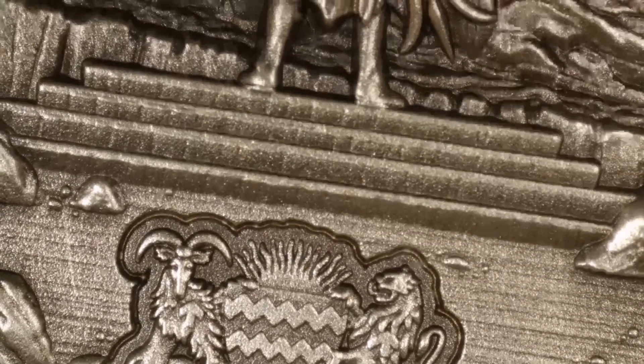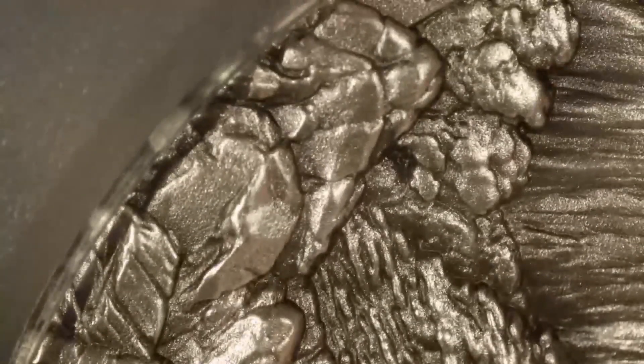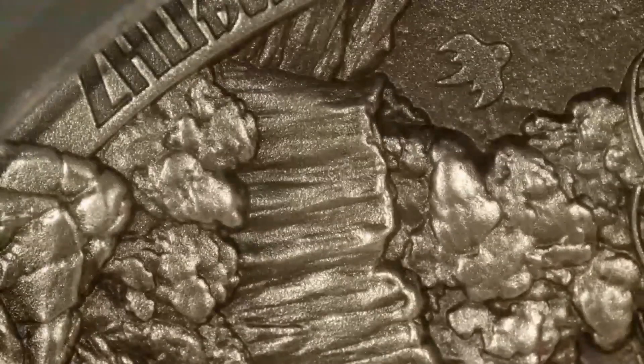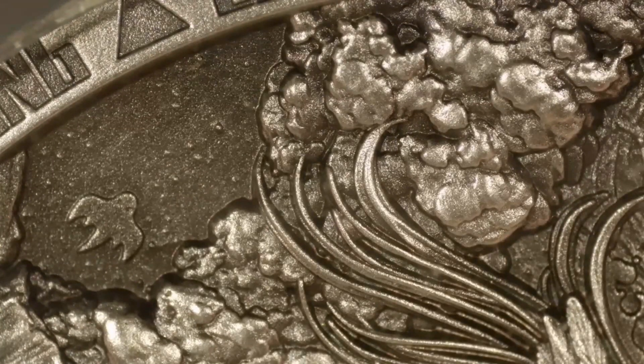Look how crystal clear. Mind you, this is my very first microscope — coin scope, whatever you want to call it. My very first, and I am in love with this thing already. I cannot wait to show you guys some of the stuff I've shown in the past, but now up close and personal.